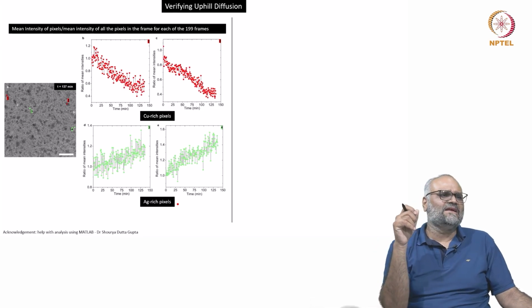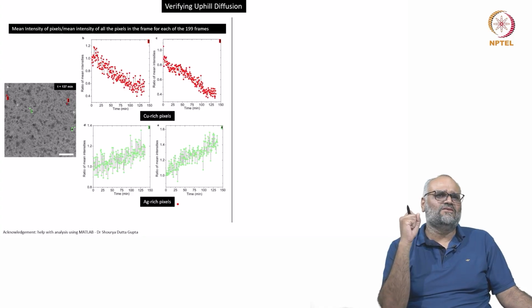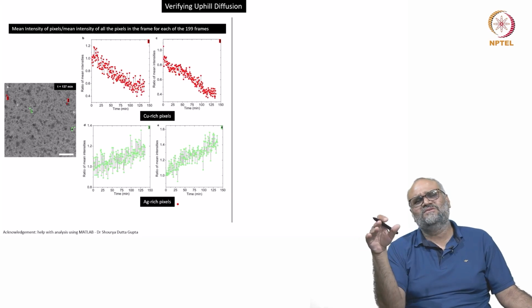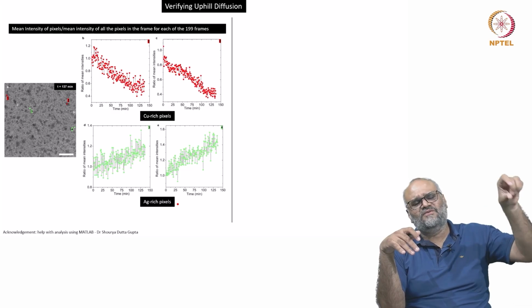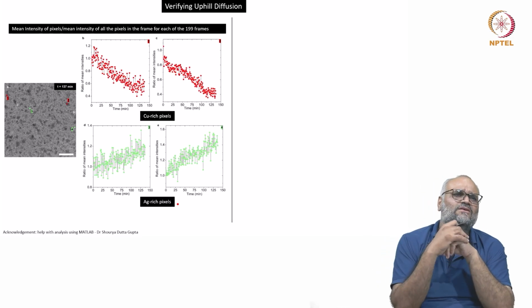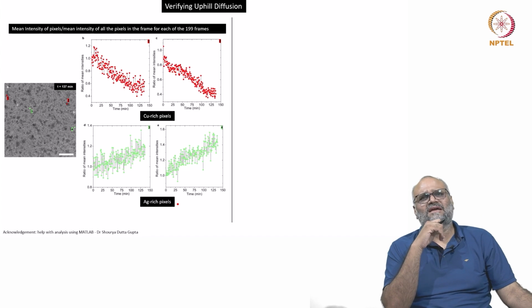And this is kind of an indication of uphill diffusion, because when the domain size is changing, you would expect the composition to actually increase, or when you look at conventional diffusion, there is always transfer or diffusion of material from a region where the concentration is high to a region where the concentration is low, whereas in this particular case it is indicative of something like uphill diffusion.